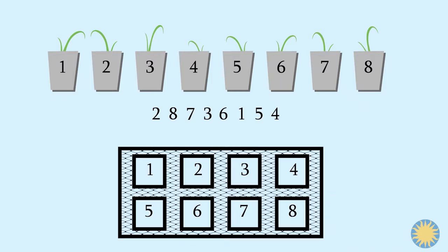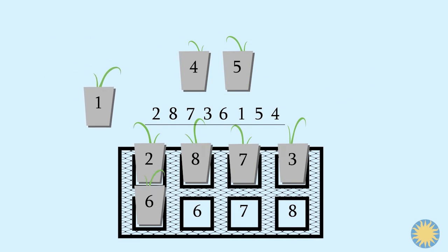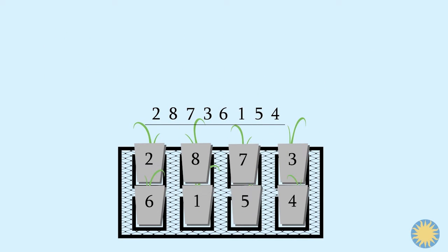We want to randomly place the orchids in the growth chamber because not every area is the same. Some spots might get more sunlight, or sometimes the spots get more water than the others. These things can lead to differences in seedling growth. Because we do not want these conditions to affect the results, we will be putting the orchid seedlings into the growth chambers in a random order using a sequence generator.